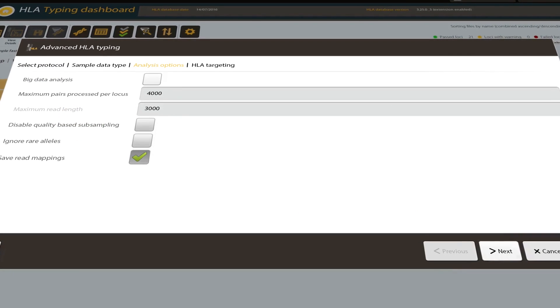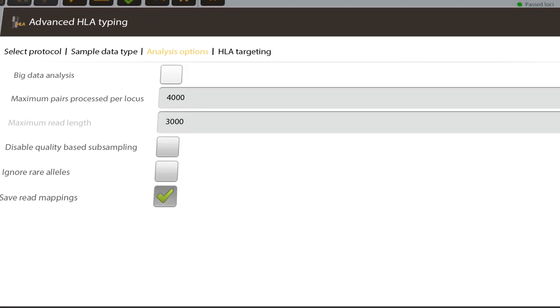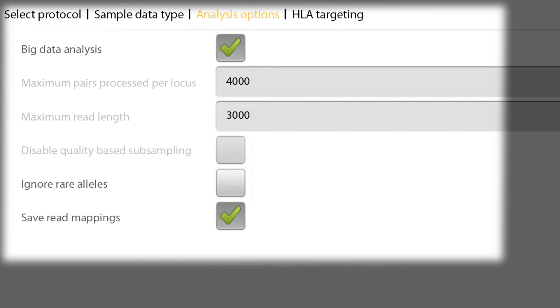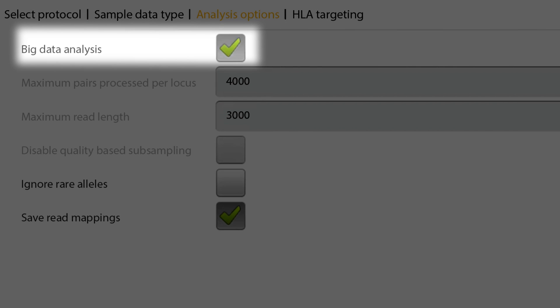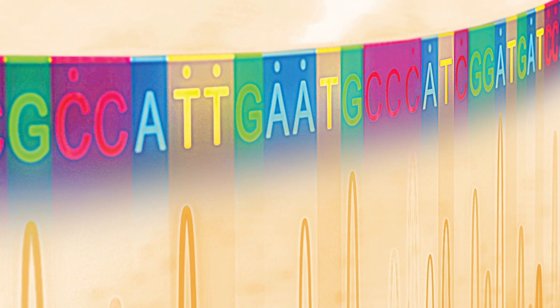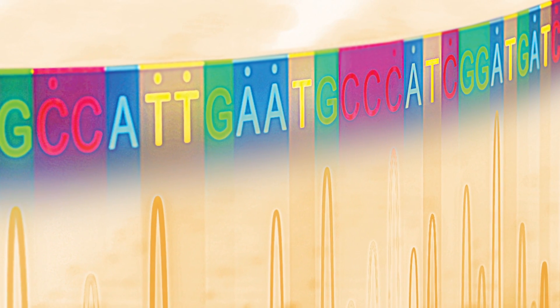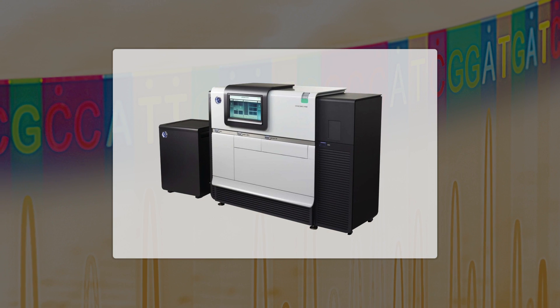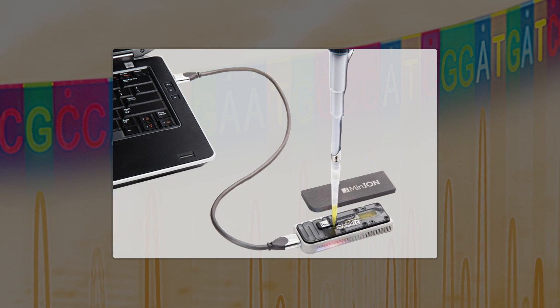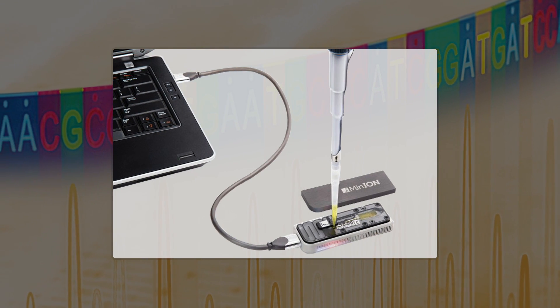HLA-Explore can be extended by two additional modules: the Big Data module for analysing whole genomes and whole exomes, and the Long Read module for analysing newer sequencing technologies from PacBio. Oxford Nanopore data analyses are under development.